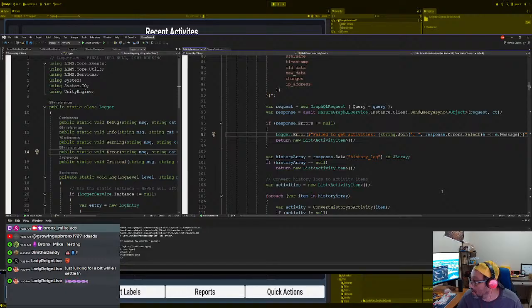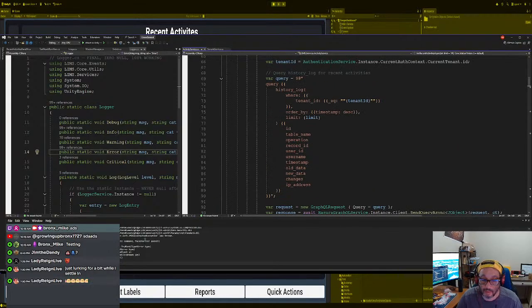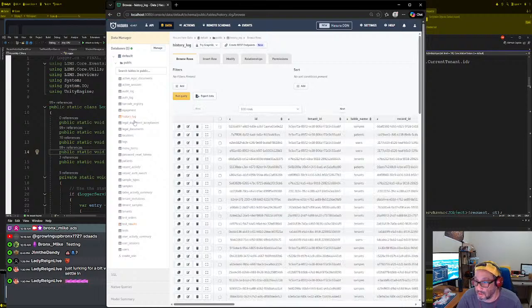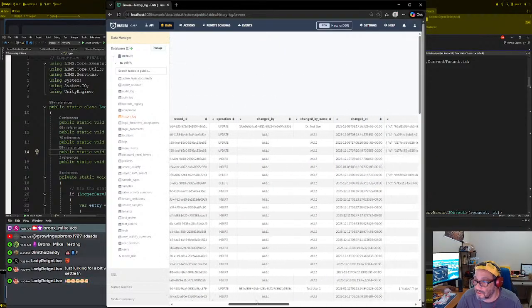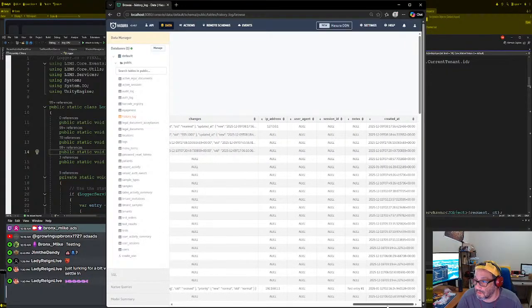But we don't have history log by timestamp. Okay, so what we gotta do, we just gotta go over here, go to the history log. Do we have a timestamp field? Operation changed by. No, we don't.